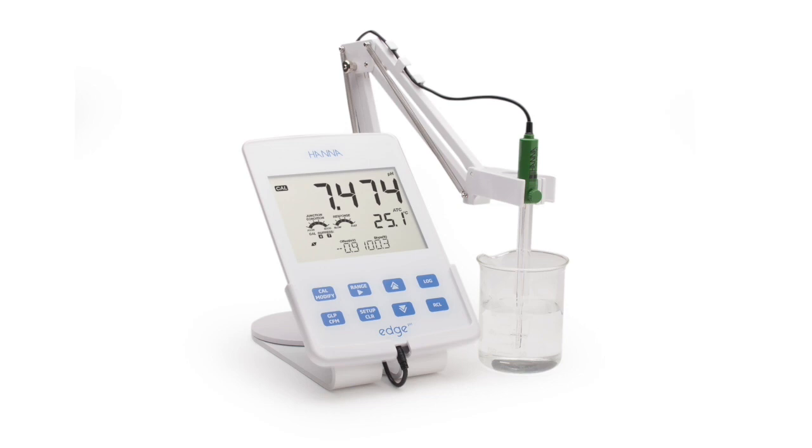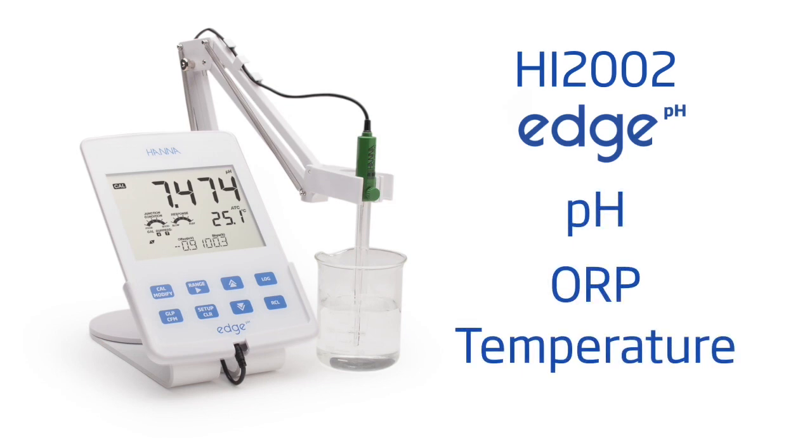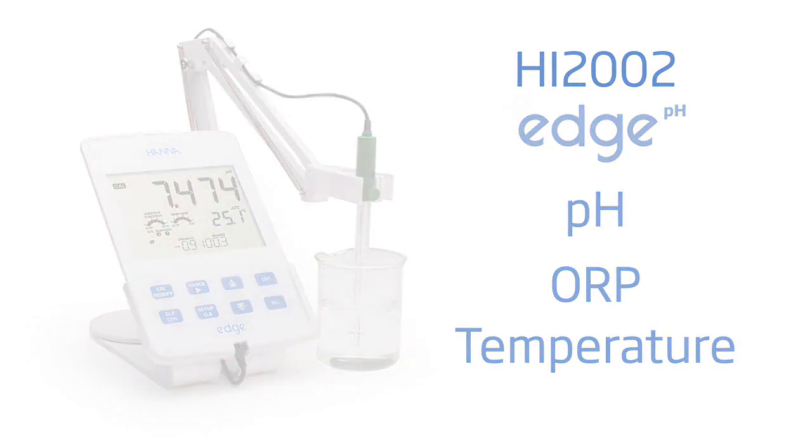The HI2002 is part of Hanna Instruments' line of single-parameter edge meters and is specifically designed for the measurement of pH, ORP, and temperature.